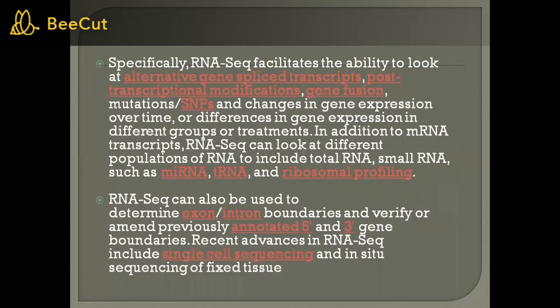Specifically, RNA-seq facilitates the ability to look at alternative gene splice transcripts, post-transcriptional modifications, gene fusion, mutations, or single nucleotide polymorphisms, and changes in gene expression over time, or differences in gene expression in different groups or treatments.